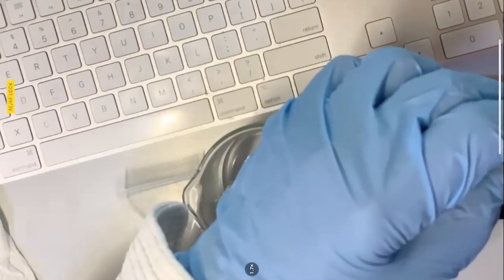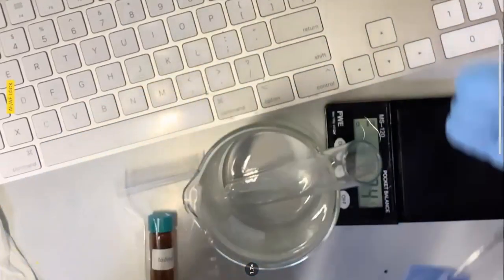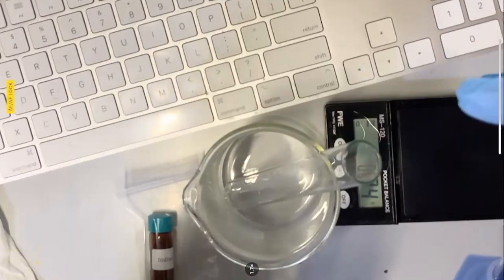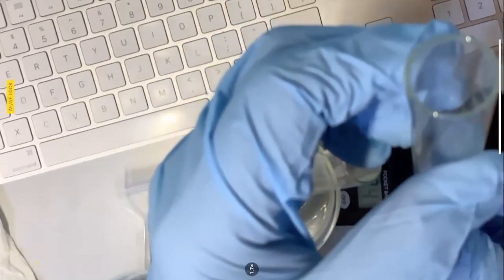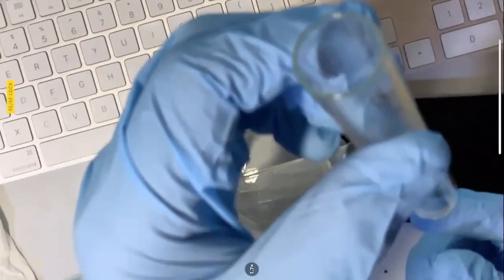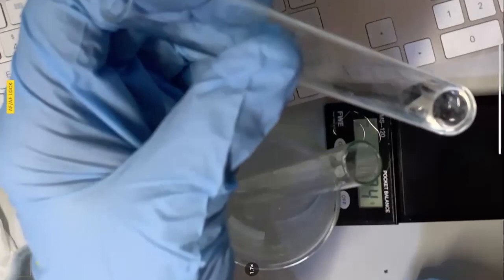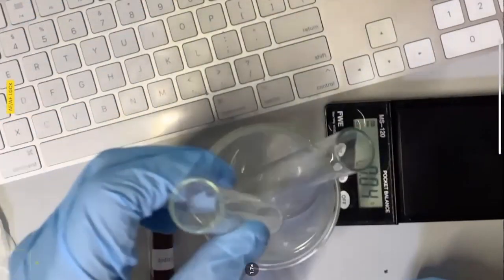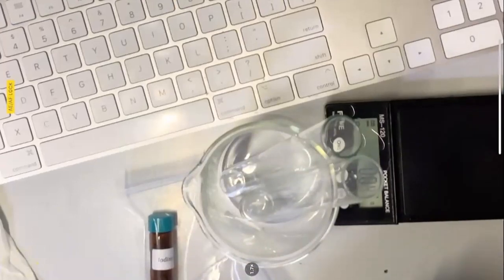Now, if I didn't get all the liquid, it doesn't really matter because I already had the mass and the volume here, and the density doesn't change just because you have a smaller volume. The mass will change proportionally, okay? So the density is constant. It doesn't matter whether you have a swimming pool of liquid or just a drop of liquid. The density is the same as long as the temperature is the same.